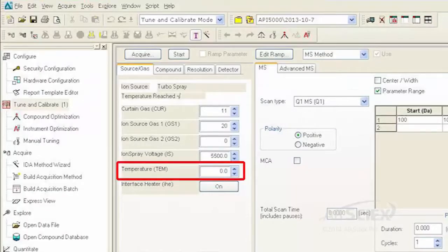If the turbo heaters are in use, set the temperature to zero in Analyst and wait 20 minutes to cool down.